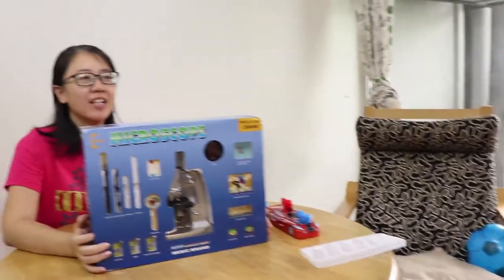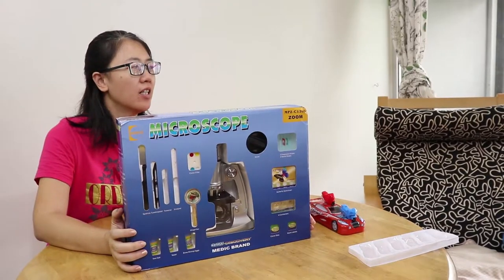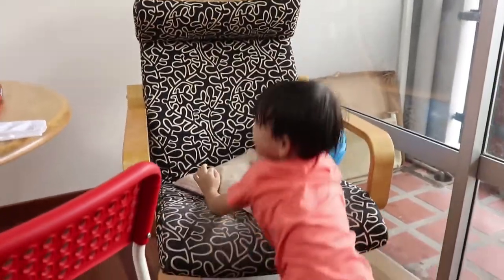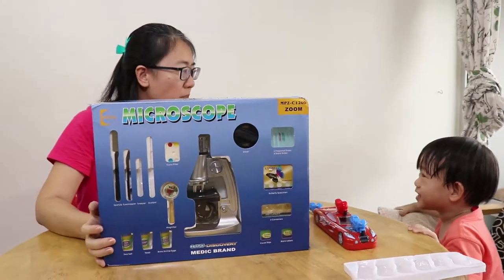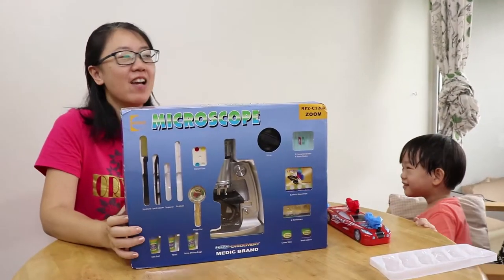I'm so excited to open it! We're wanting to observe. We will look through a microscope so we can see the tiny tiny bacteria. Do you think we can see bacteria? I don't think so. We don't think so.